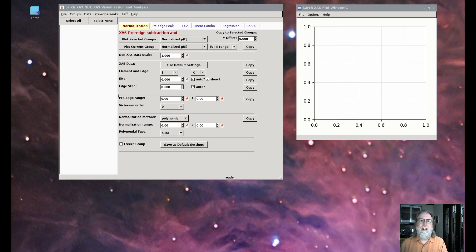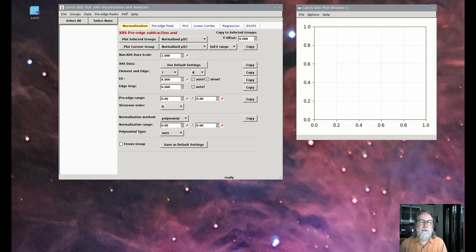Hi, I'm Matt Newville, and this is part of the video series for using LARCH for XAFS analysis. So far in this series, we've worked with XAFS and chi(E) data as a function of X-ray energy and treated chi spectroscopically, thinking about the spectra in terms of the electronic energy states of the absorbing atom.